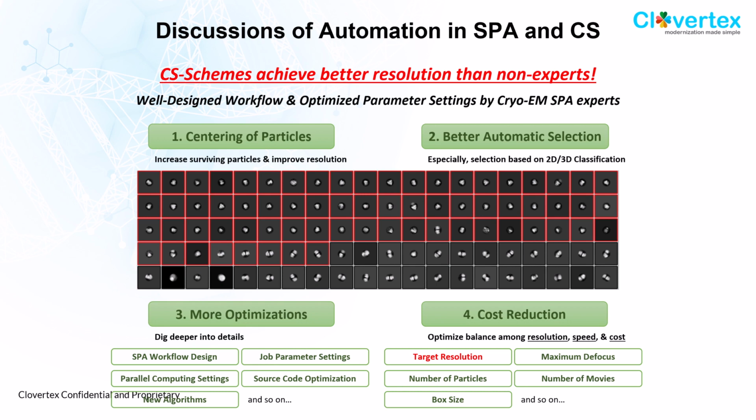So basically this means that the well-designed workflow and optimized parameter setting by a Cryo-EM SPA expert, which is current me, does really better than the manual procedure often. So this indication was very encouraging for us. So we will continue working on this and do more optimization and the cost reduction.